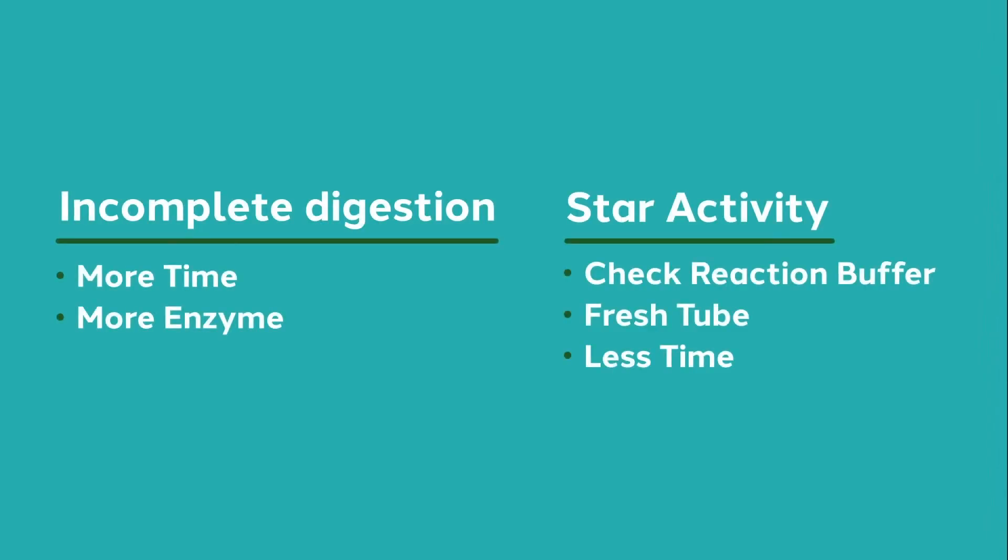To deal with incomplete digestion, allow the digest to run longer or add more enzyme — refer to the manufacturer literature, as this is not always a simple choice. Some enzymes are stable for several hours, so extending incubation time is sufficient. Other enzymes lose activity within a few hours; in that case, adding more fresh enzyme midway through the reaction is needed. To deal with star activity, double check that you are using the correct reaction buffer, that it has fully thawed and been resuspended, that it has been diluted correctly, and pay attention to the timing of your digest.